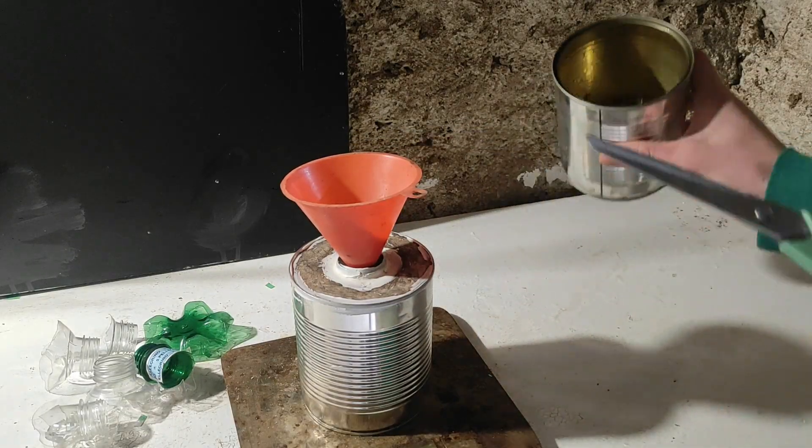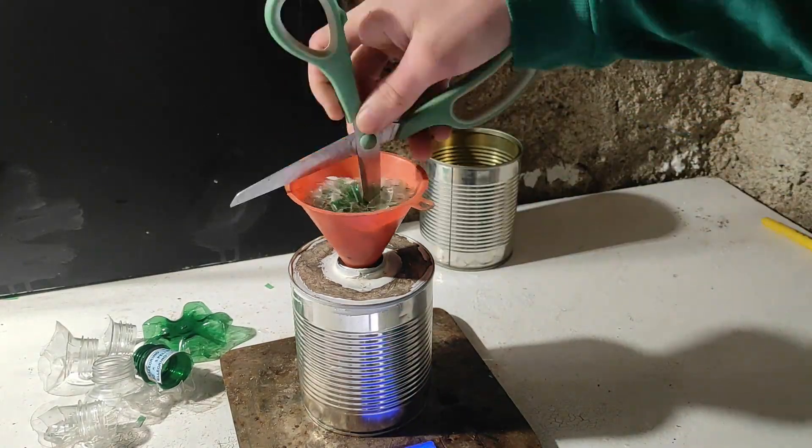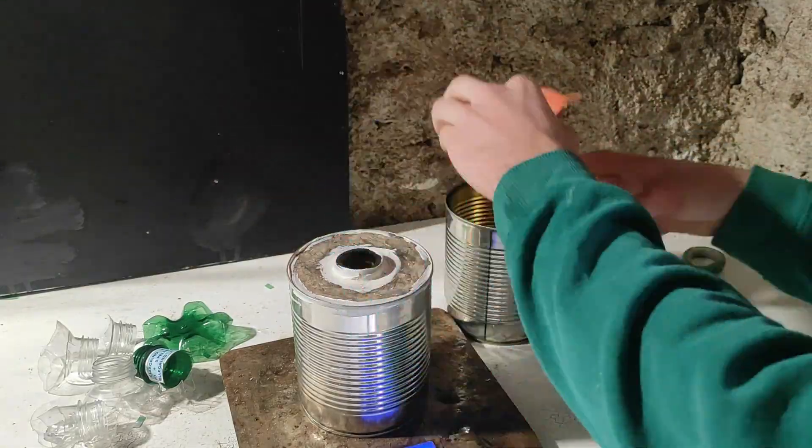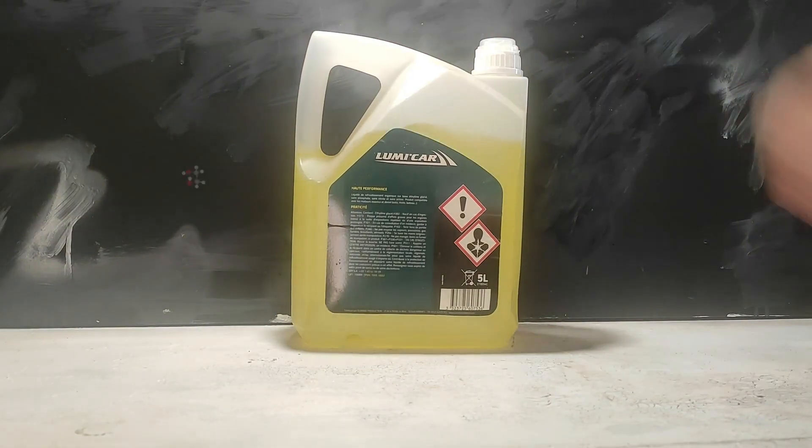When we have the PET gravel, we can pour it all inside a reaction can, and I made this one myself, but you can use a paint can as well. The next reagent we need is ethylene glycol.